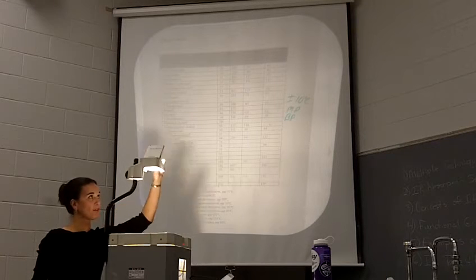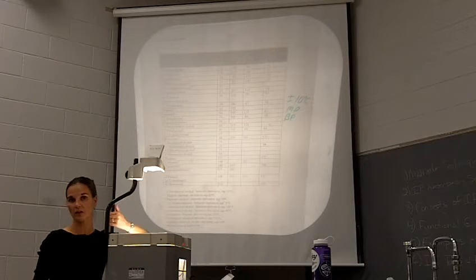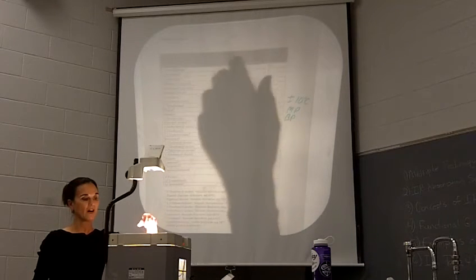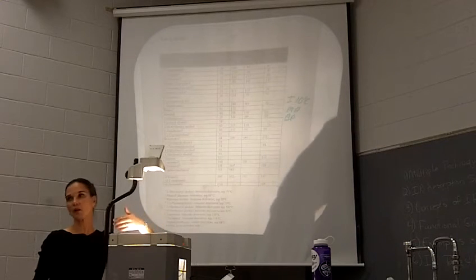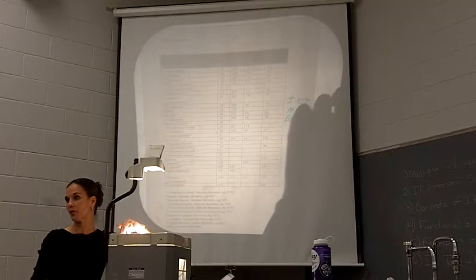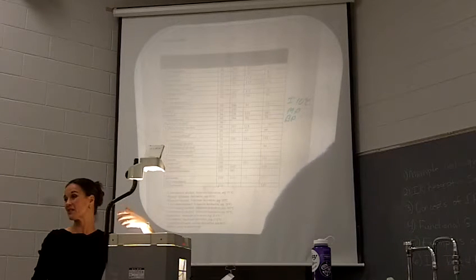And so once you've gone through all of these pieces and gotten down to what is definitely the functional group present in your unknown, you go to the back of your book, look in the appendices, find that chemical class, find the area of the melting point or boiling point, and then you're going to look up the literature IR spectra of the compounds that are plus or minus 10 degrees of your melting point or boiling point, and then find what matches, okay?